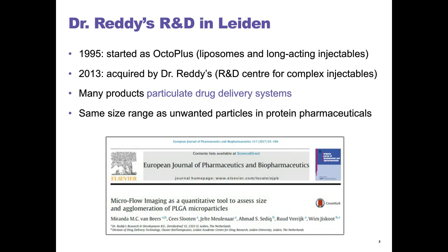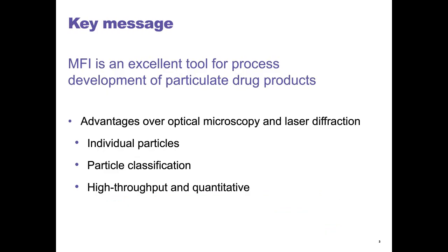What I will discuss in this presentation is that MFI can be an excellent tool for process development of particulate drug products that fall in the micrometer size range. It has several advantages over the more routinely used techniques of optical microscopy and laser diffraction. And this is because MFI is able to characterize individual particles and to measure thousands of particles per sample.